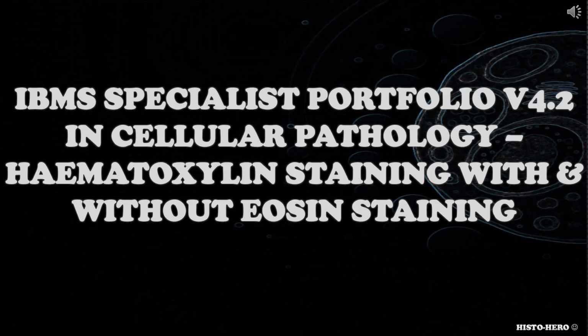And today's video will be about haematoxylin staining with and without eosin staining, which is part of the IBMS specialist portfolio in cellular pathology.